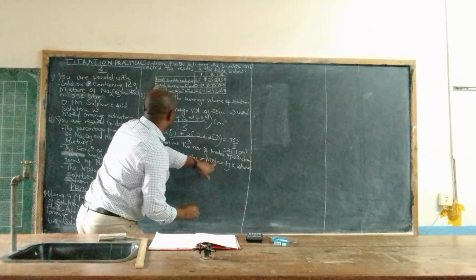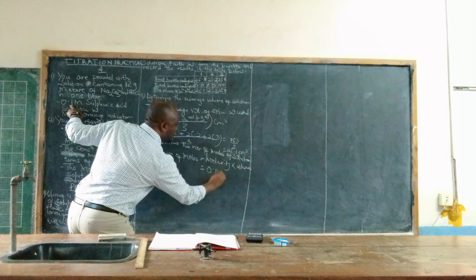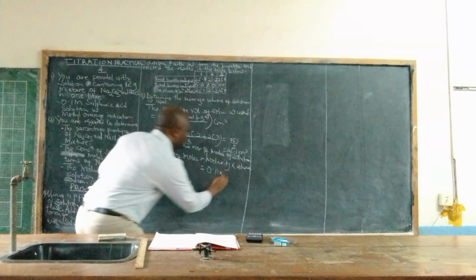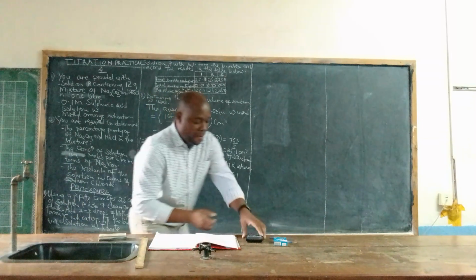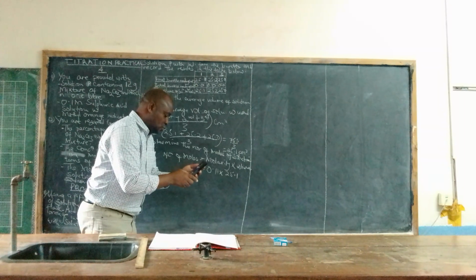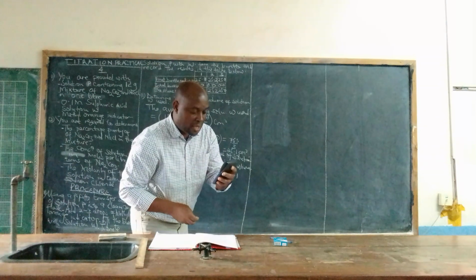The molarity of W we have been given here, it is 0.1. So we write here 0.1 times the volume. This is the volume that we got, the average volume. So we are going to use the average volume, 25.1. We go back to our calculator here, which is giving us 0.1 times 25.1.